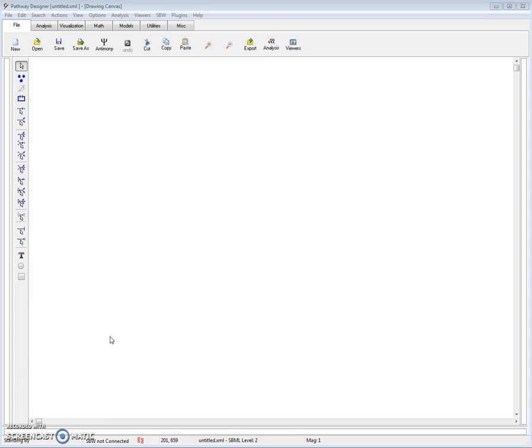Pathway Designer is a tool for drawing chemical or biochemical networks on the screen and then simulating the resulting networks.